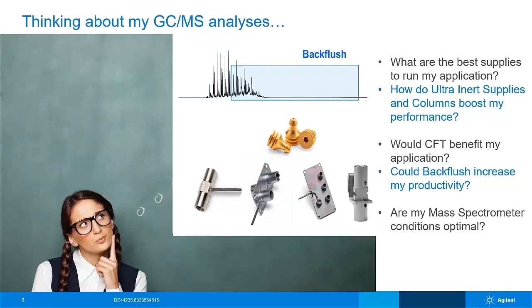spec at higher temperatures? Today we'll discuss a number of these ideas, from selecting the right liner and column for your application, to the various techniques that can be used with Capillary Flow Technology, or CFT, and how to make those CFT connections. And then we'll wrap up with a discussion on the optimal conditions on a single quad and tandem quad mass spec.